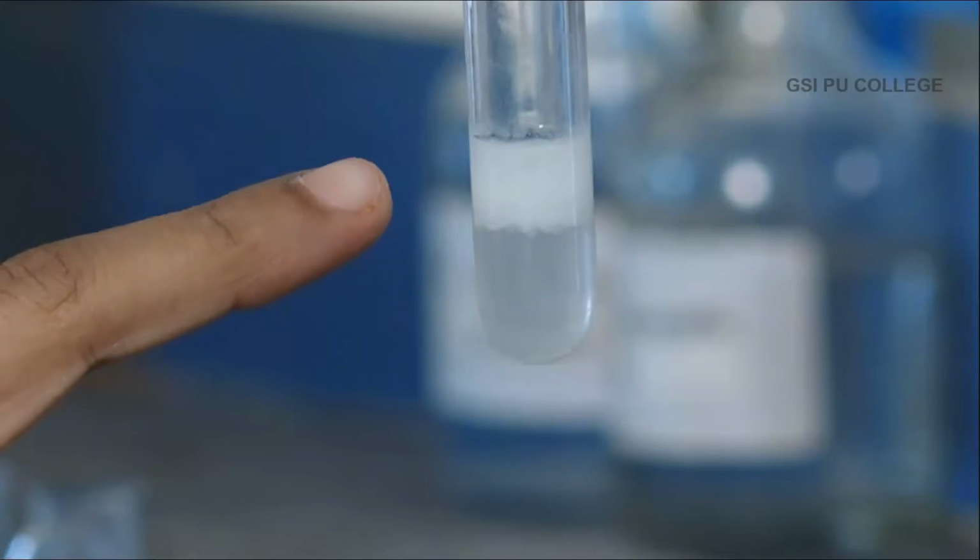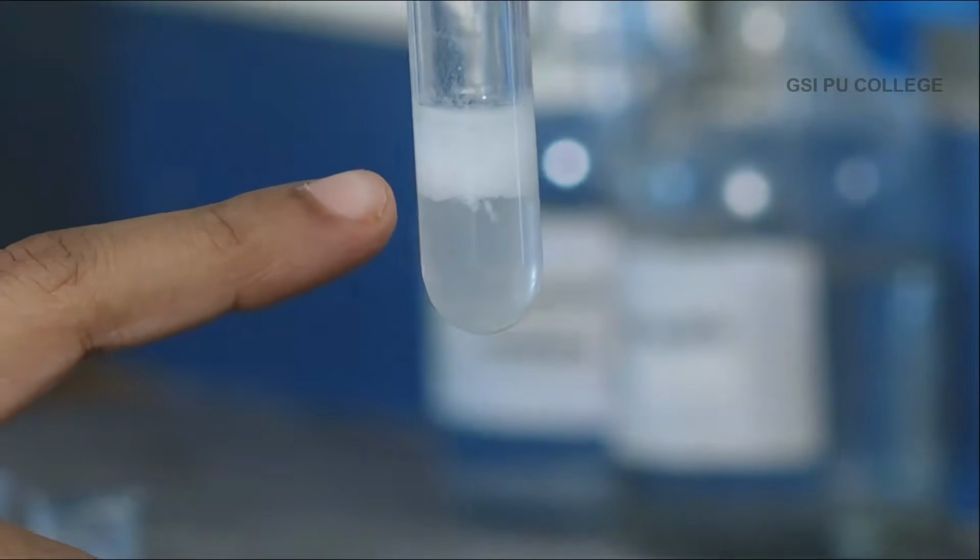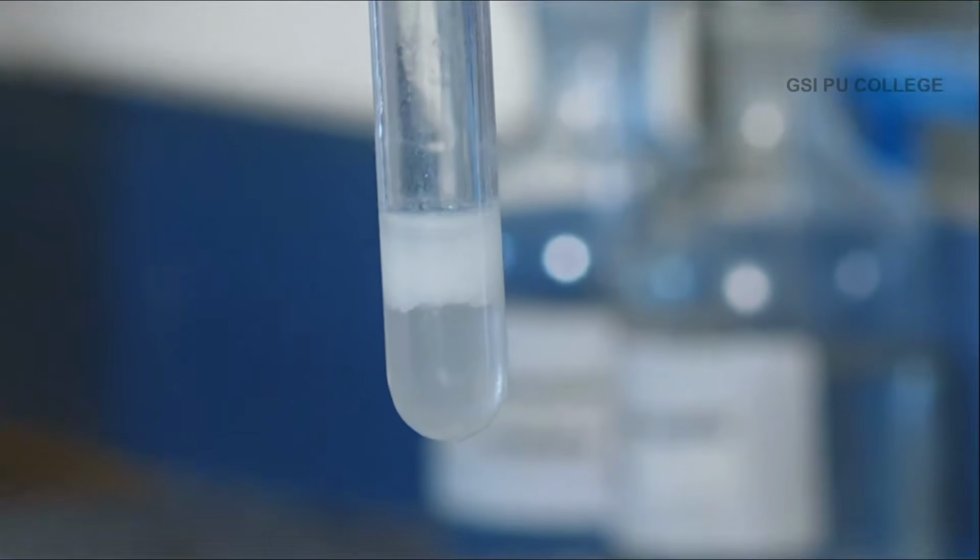You can observe a white precipitate is appearing, which means that fifth group basic radicals are present. So, fifth group basic radicals are present, and the three radicals of fifth group are barium, strontium and calcium. So, you have to analyze these three radicals to find which one is present, that is, it may be barium, strontium or calcium.